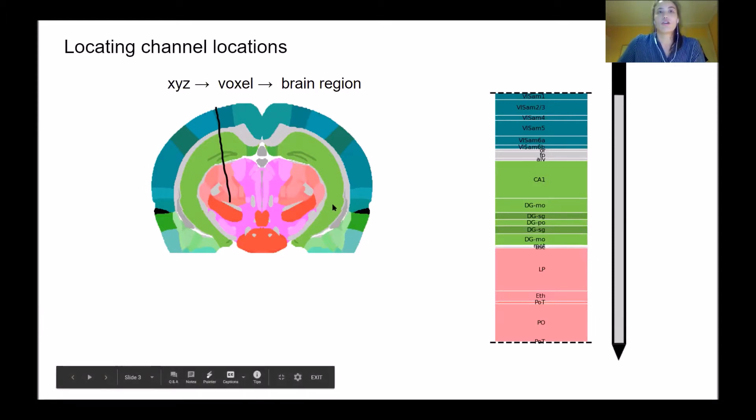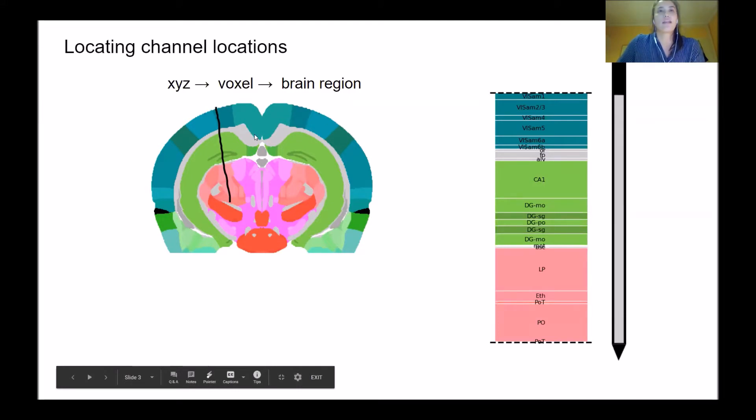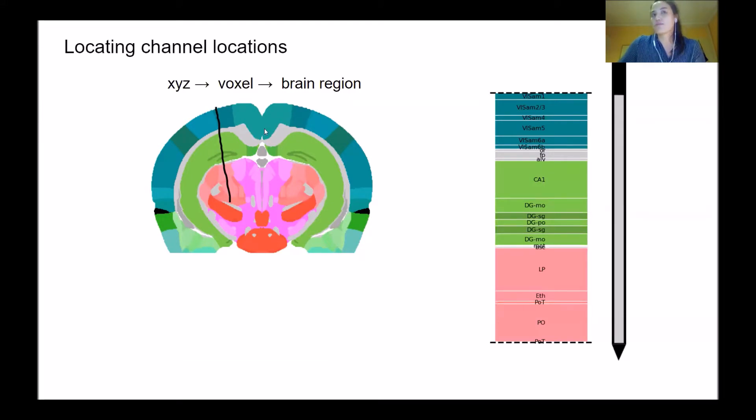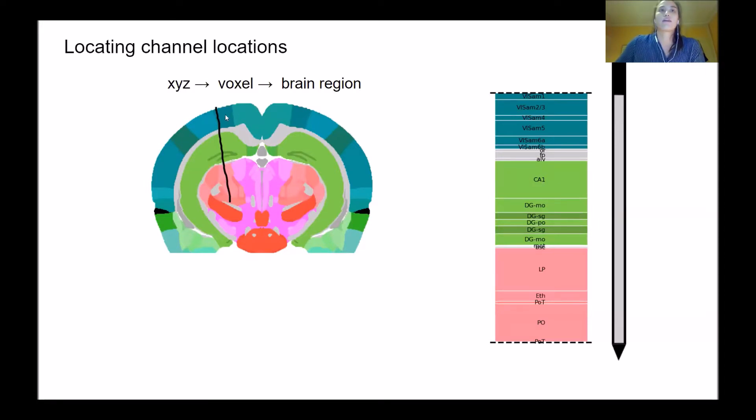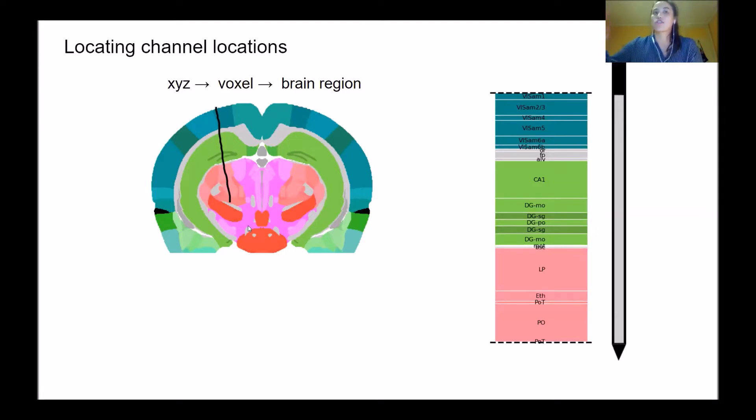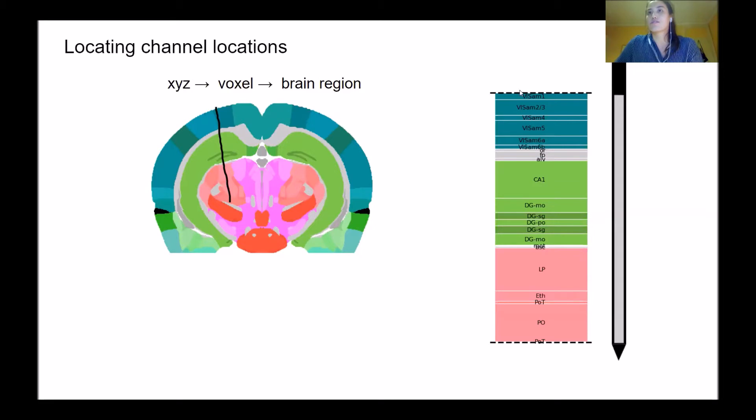On the left here I show an example of a coronal slice. This is the Allen label volume, where each different color shows different brain regions in the Allen atlas. The black line shows the electrodes distributed along the probe. We can also visualize this in a 2D format showing the regions through which the electrodes traverse.